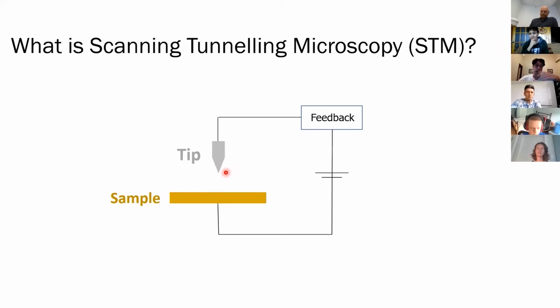Now, this tunneling current is only allowed because of two things: the very short distance between the tip and the sample, and the fact that quantum tunneling allows for electrons to jump from the tip to the sample and vice versa. So using this method, you can get an idea of the topology and even get a look at the atoms in the sample, analogous to how somebody could get a mental image of an object by feeling it with their hands.